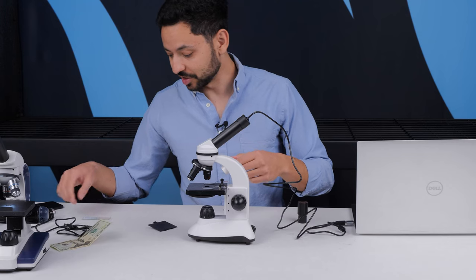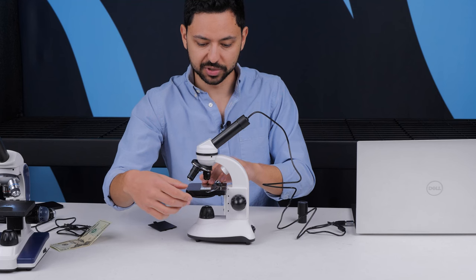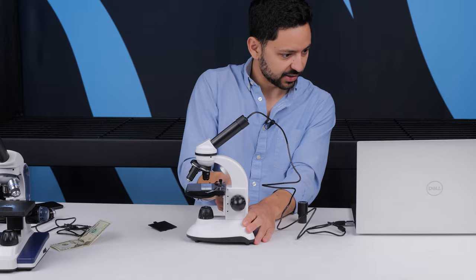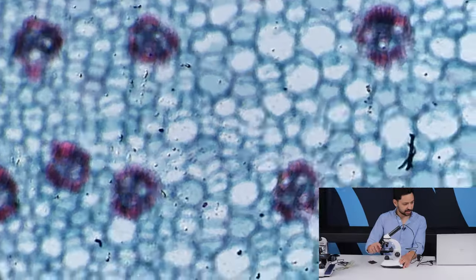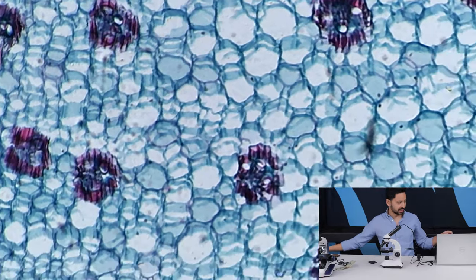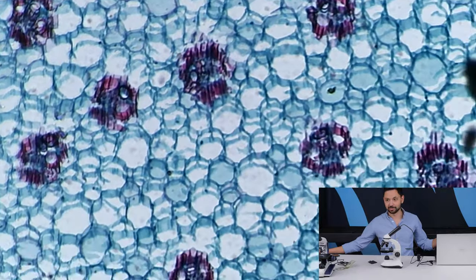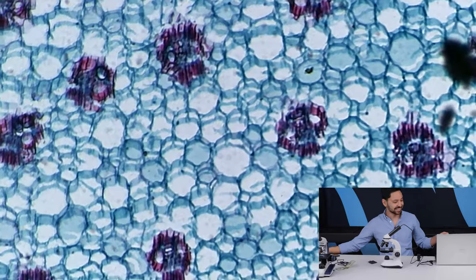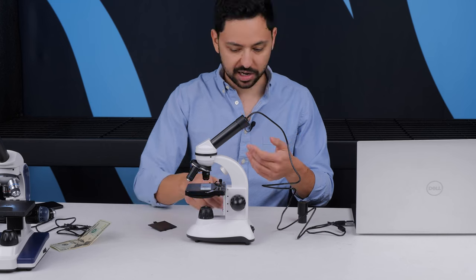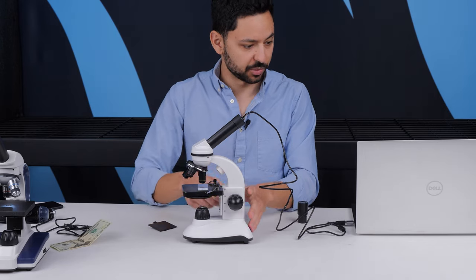We also found a microscopic centipede — you can see its skin clearly. Even the lowest magnification on this compound microscope is almost too much for Micro Safari specimens. Now I'm going to show the $50-60 compound microscope: you can see that just touching the microscope stage causes it to go in and out of focus, and barely touching the table makes the whole sample move around. The image quality is not quite as good, and this problem gets worse at higher magnifications.